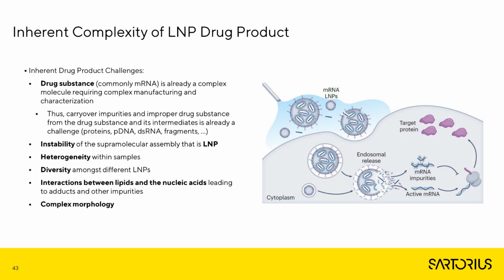For this, it is very important to use appropriate, comprehensive analytical methods. Because of the complex chemical structure, and because you can use different types of lipids and so on, you are creating a huge heterogeneity across different samples and within the same sample.